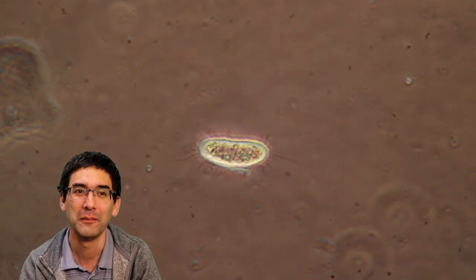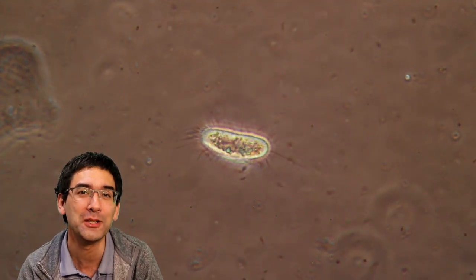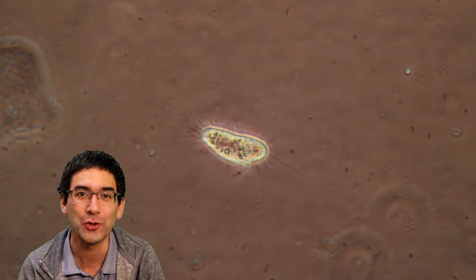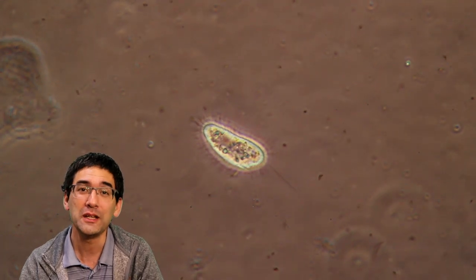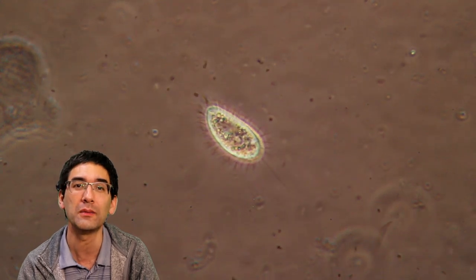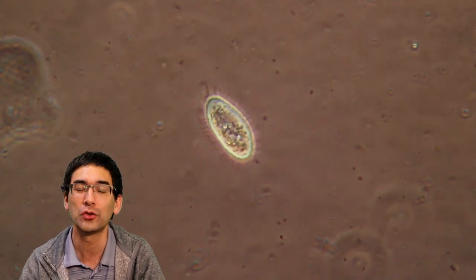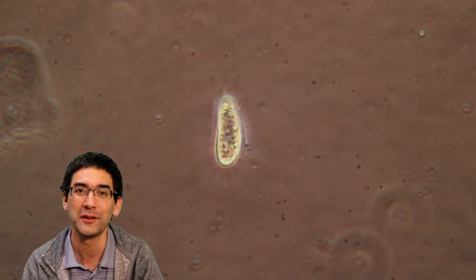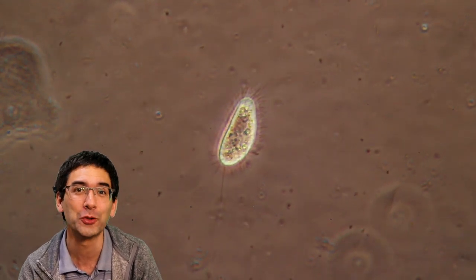You can see the ciliate moving around here, and also some bacteria. This, by the way, is in phase contrast. You have to wait maybe around a week or two weeks until the algae starts to develop, and you know that something's happening if the whole thing turns very green.